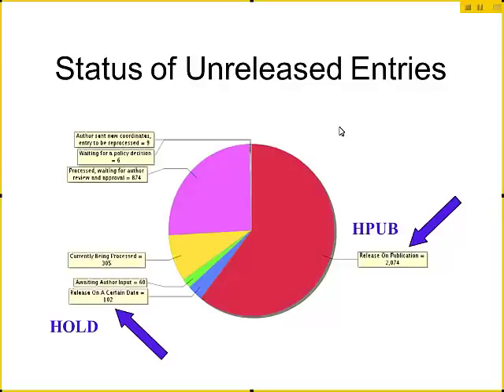The issue is, once you see a paper come out about a structure and you want to go look at that structure, you may find that it is on hold for at most a year past publication date. That is what this small slice of structures represents — they're on hold until a certain date. Most structures, though, are held until publication, and within a week or two of the article coming out, those coordinates will be publicly available. Those structures are under the classification HPUB.